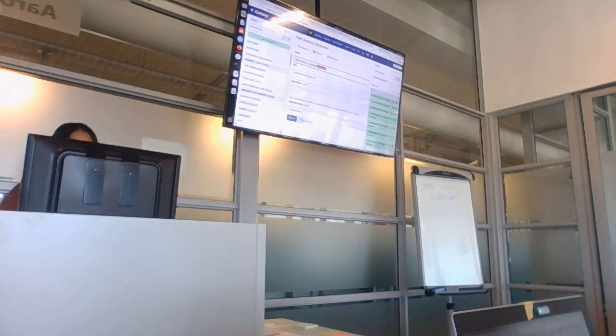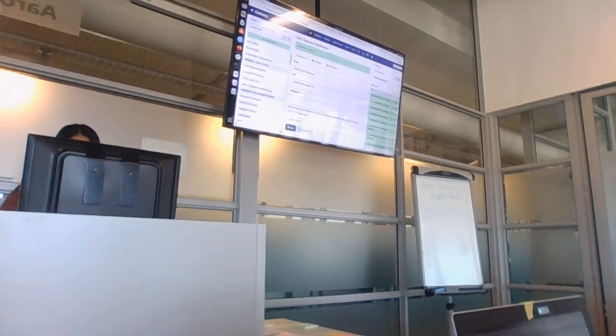Is yours still uploading, Dafa? Do you want to change your file names? Just delete all of this until the question mark so that it just ends in .gz. You should have, I think, 14 files, right? 16 files. 16.